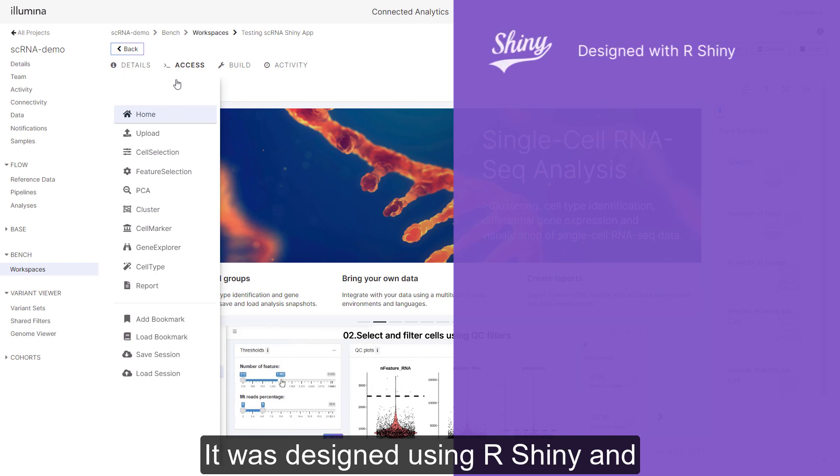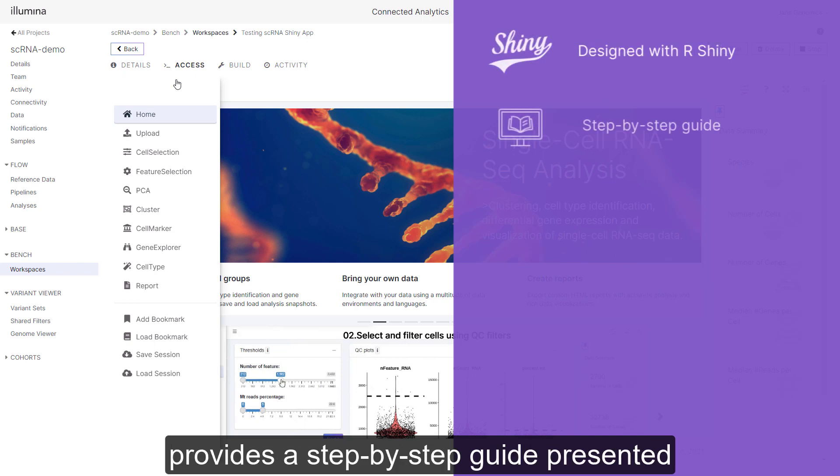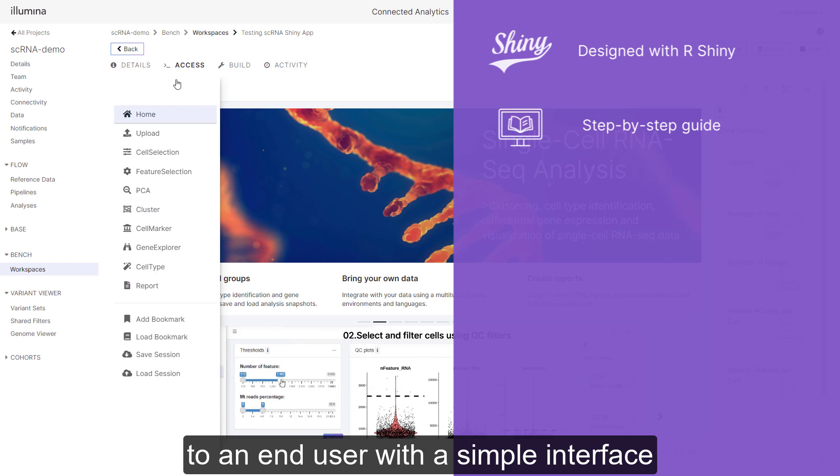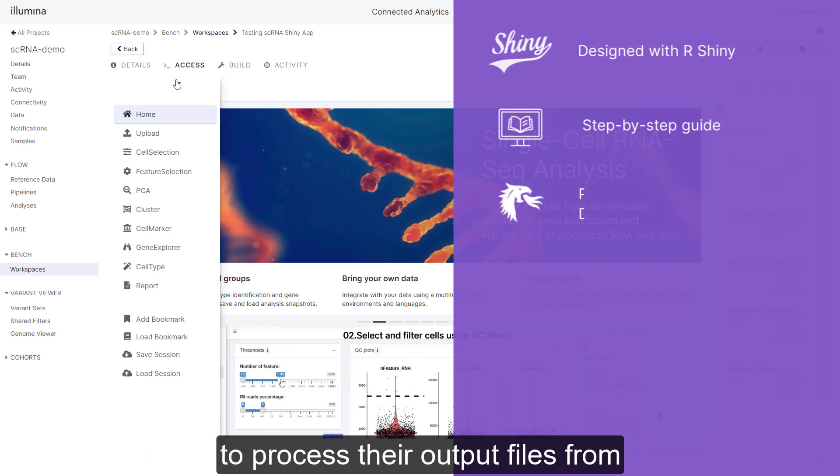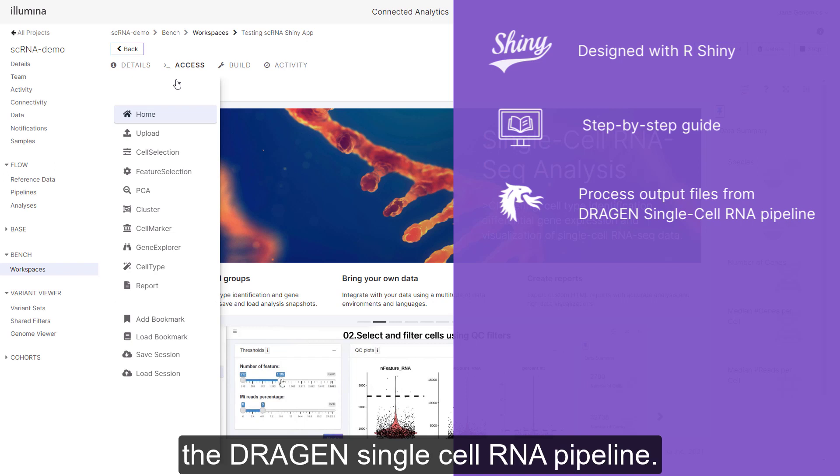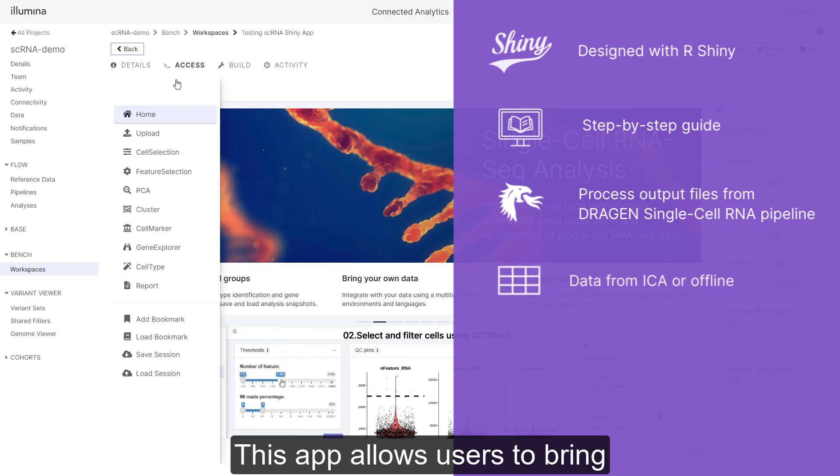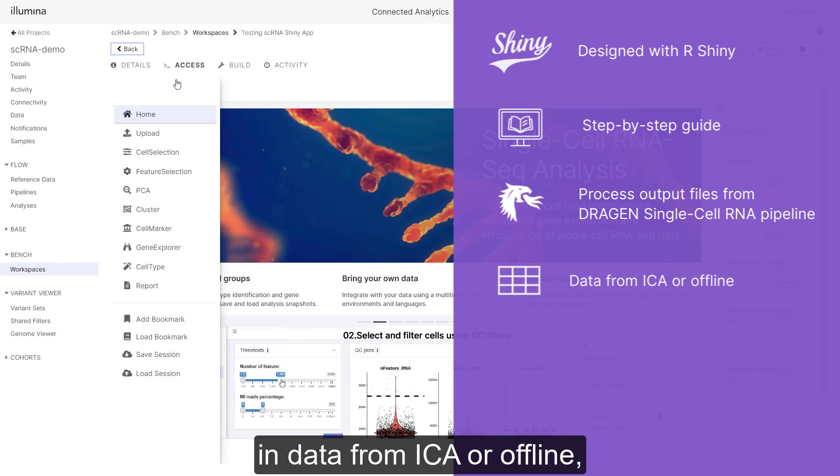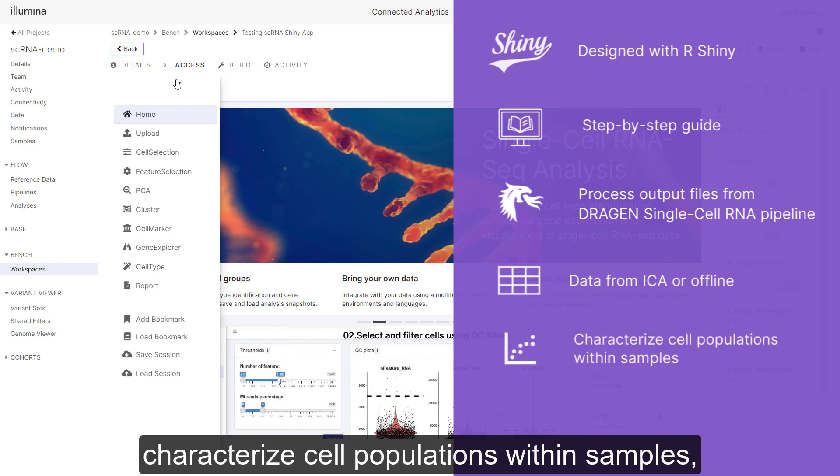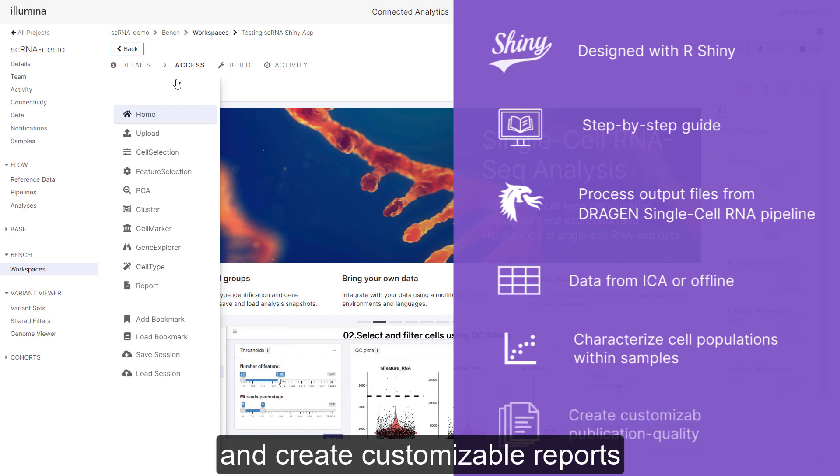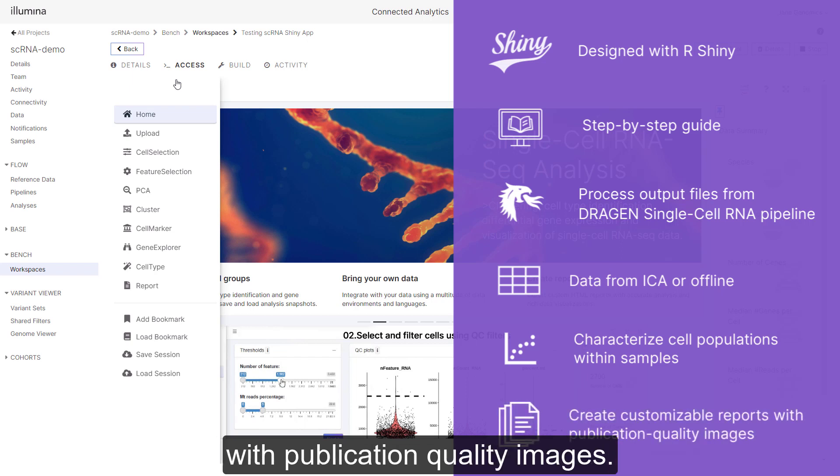It was designed using R Shiny and provides a step-by-step guide presented to an end user with a simple interface to process their output files from the DRAGEN single cell RNA pipeline. This app allows users to bring in data from ICA or offline, characterize cell populations within samples, and create customizable reports with publication quality images.